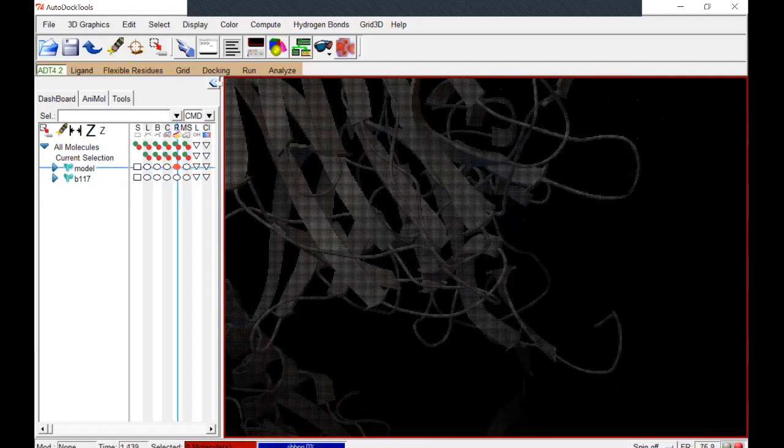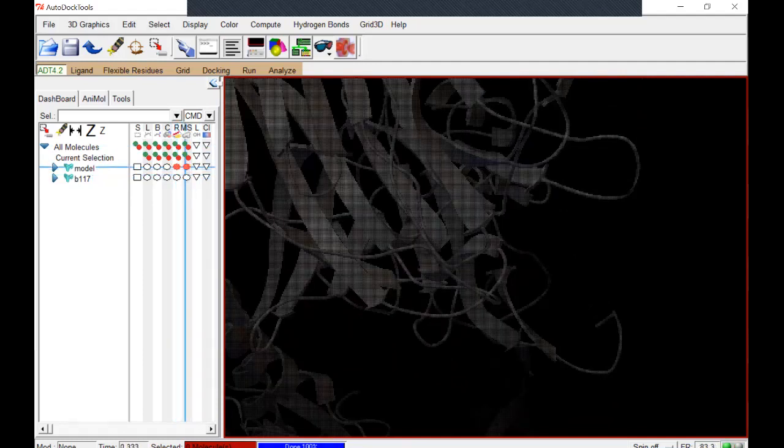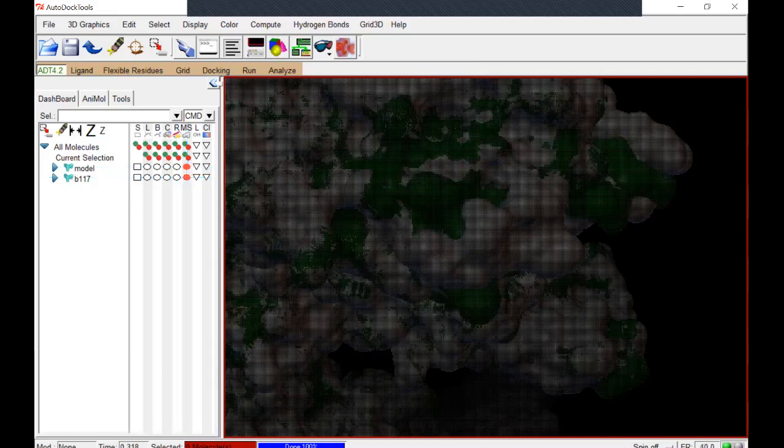That's what you were seeing with the three-dimensional space rendering.